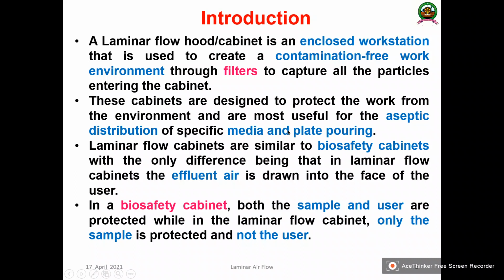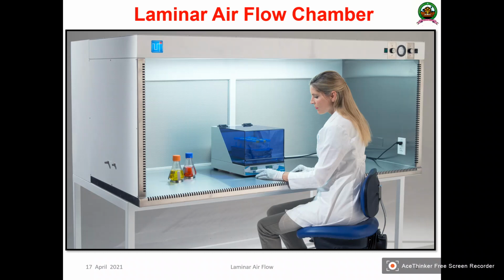And this is one of the important aspects of sanitation microbiology, especially to prevent the contamination that is happening in the air through the major type of physical method known as filtration. As you can see here, this is the laminar airflow. You can see the same instrument in our laboratory also, where generally students don't use this one, but the pouring of the media is done by researchers and faculty members. Even students use it when you go for higher levels like post graduation studies.